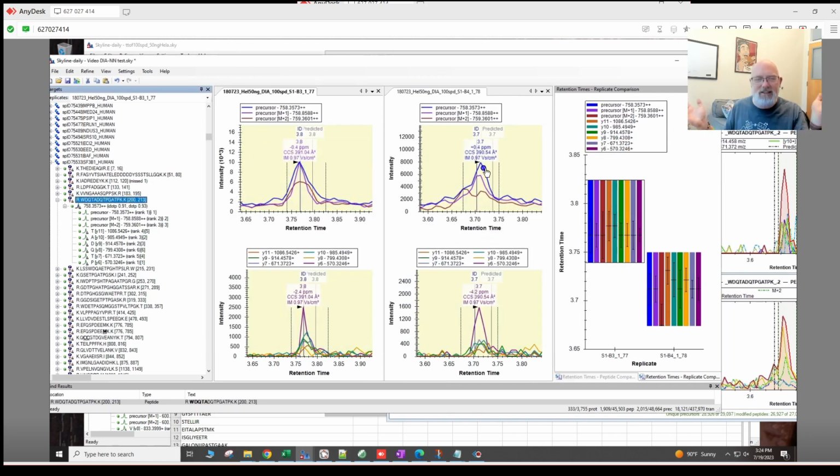Okay, that's it. That's all I know how to do. I think we're like 95% there. As soon as we get that one thing worked out in the import of peak boundaries, or whether that did anything, I don't know. I'm going to have to do more experimentation. But anyway, that's what I got.